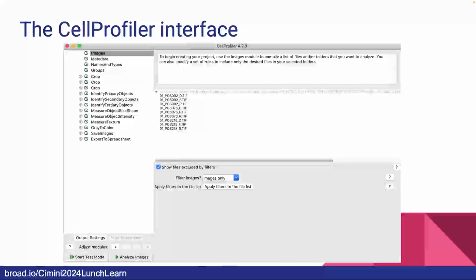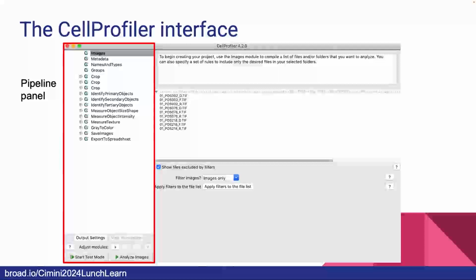So we really do try and design it for you guys. Again, I'm going to just give you a quick overview because I think this is a tool that for some of you is the right tool to do your image analysis, but we're not going to belabor this. CellProfiler, why would you use this instead of ImageJ? Well, CellProfiler is at its heart an image analysis workflow tool. For those of you who are comfortable coding and writing ImageJ macros and things like that, great. You're probably good staying with ImageJ unless you have tons and tons of images, because ImageJ has a ton of plugins. Fiji is great.